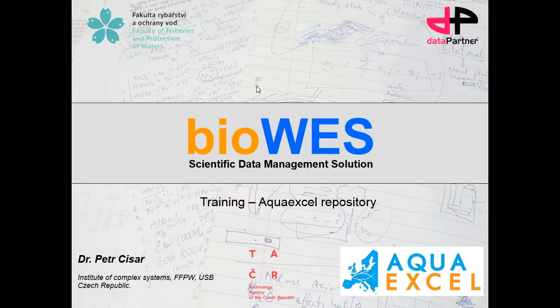It should serve for the management of experimental data and also protocols, because we believe that only experimental data together with a full description of the experiment is useful from the reproducibility point of view.